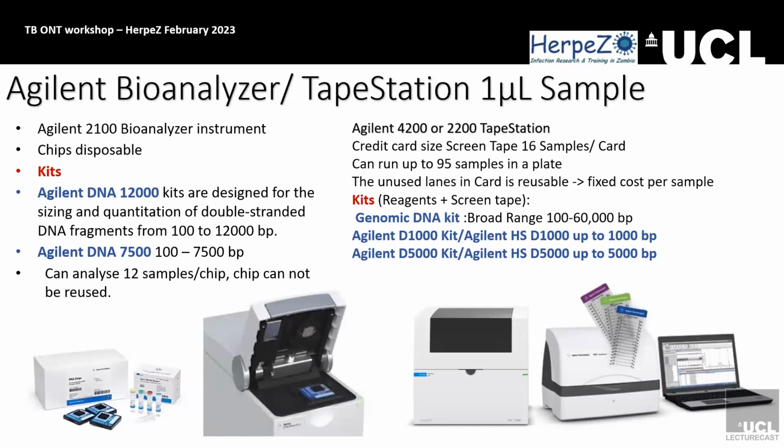So yes, the TapeStation. It's a big machine, and you have this small tape that has spots where you add your samples. It's basically like running a rapid gel.